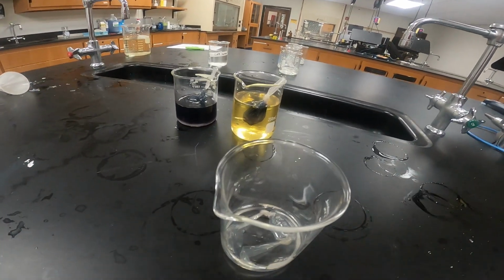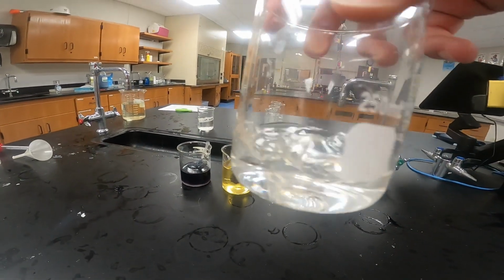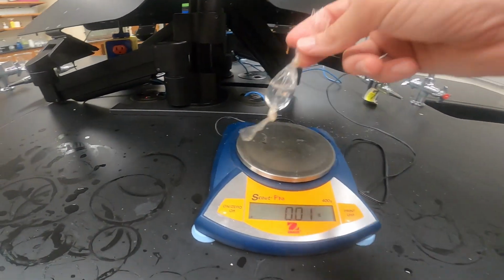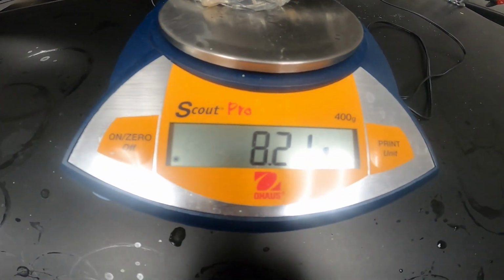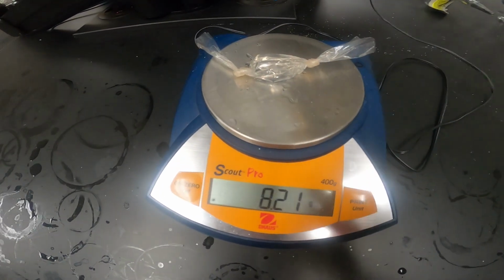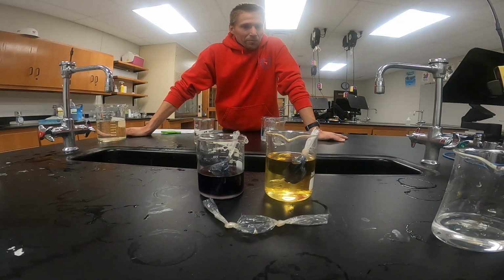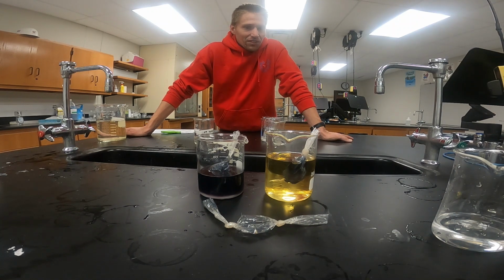So it's been 30 minutes. Now we're going to take our balloon out of our unknown concentration of sucrose solution and weigh it, and then we'll see what the final mass is. We had an initial value of 7.15, and now we're ending at 8.21. So our final value is 8.21 for our dialysis balloon with the 1.0 concentration inside the balloon. Hopefully we're able to see some movement of different molecules or water throughout this lab process.